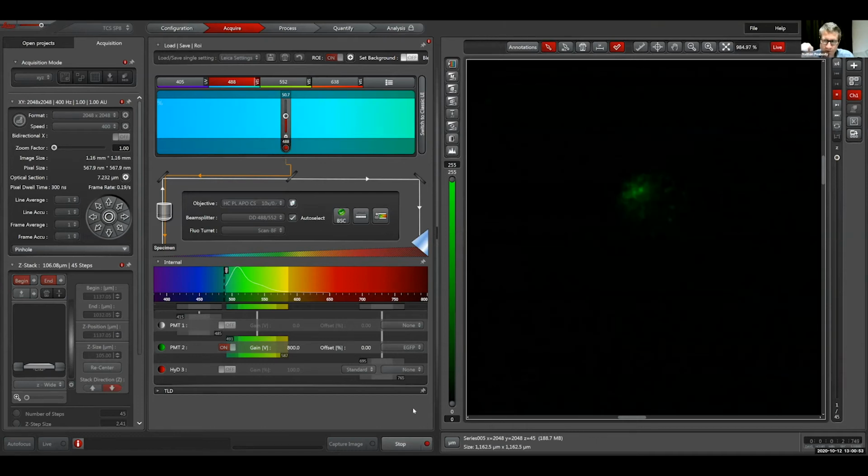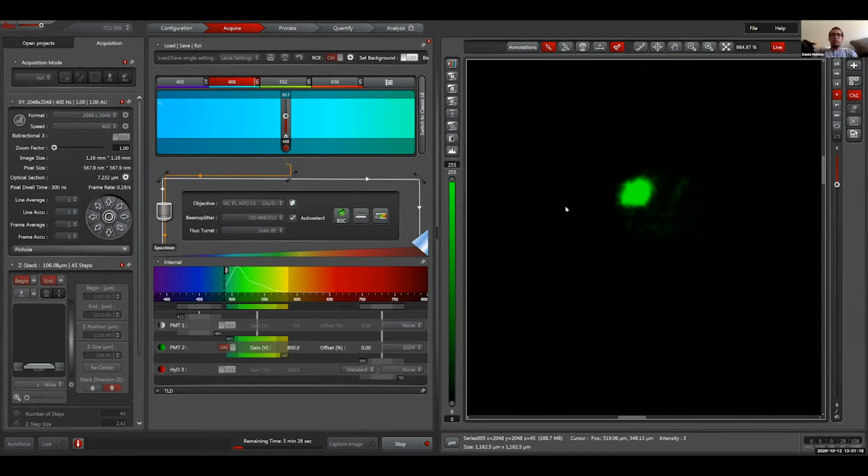I'm just basically going gizz, gizz, gizz, gizz. Oh, okay. I see what you mean. Because I don't care about a blobby picture of one cell. I just want, but it still has GFP. Let's do this 3 times and then go back and take a bigger picture and compare, and just say, did it get less bright? Okay. Yeah. So it still looks like it's just as bright.